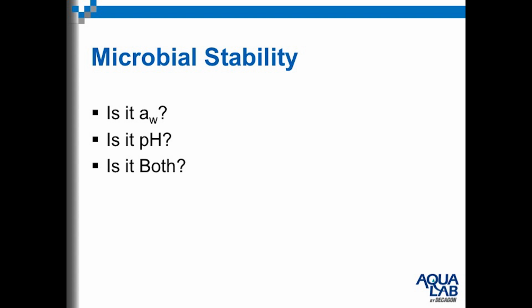And the talk today is going to be very focused on microbial stability. When we talk about water activity and pH, that's really what we're emphasizing: how you can use these measurements or these tools to make sure that your product remains safe from microbial contamination.